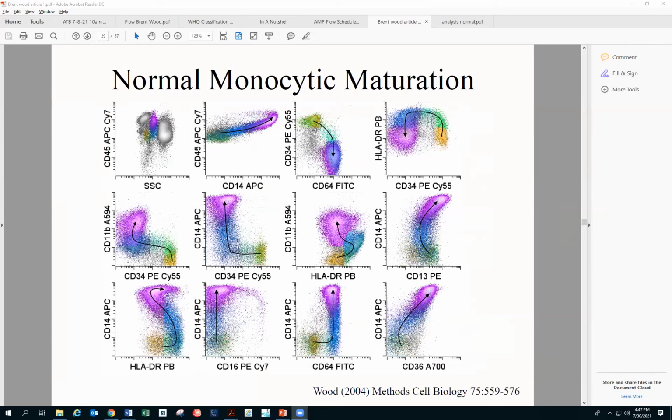Yeah, I have one more. Which marker do you use for immature monocytes? For mature, I get it, like CD14, CD11b, we see that trending. But for immature monocytes, how do you differentiate them from the immature myeloid lineage? Okay, unfortunately, there is no marker.